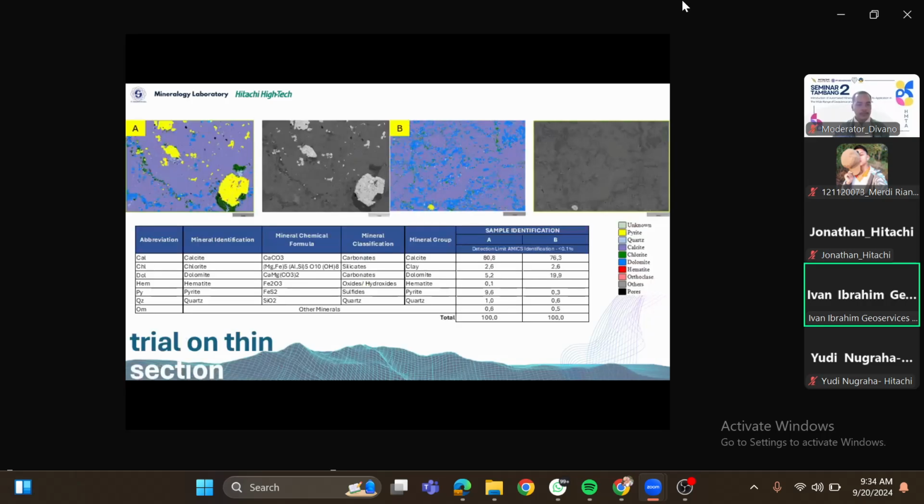Oke, next. Nah ini trial result-nya pada sampel sayatan tipis petrografi karbonat. Kita bisa mengkuantifikasi dari mineral-mineral tersendiri. Menurut saya ini sangat esensial ya, ternyata bisa jalan di karbonat juga gitu. Ini sebenarnya out of main topic, tapi saya pengen mengenalkan juga, karena align sama sesi hari ini terkait automated mineralogy, bahwa di satu sampel kita bisa memberikan data yang banyak.